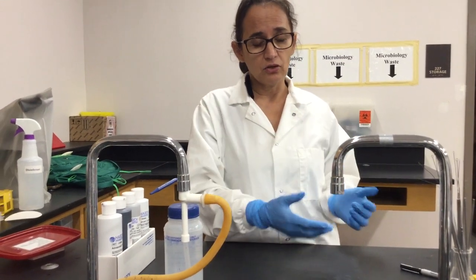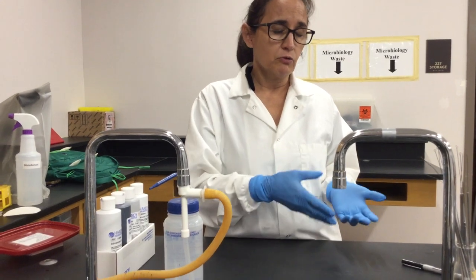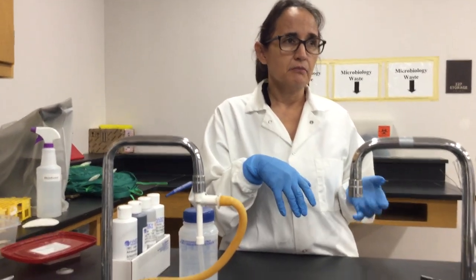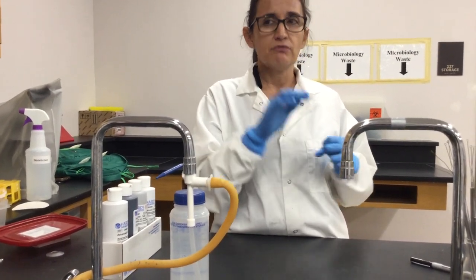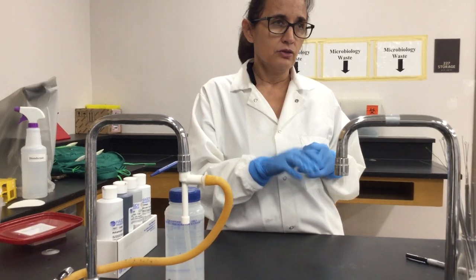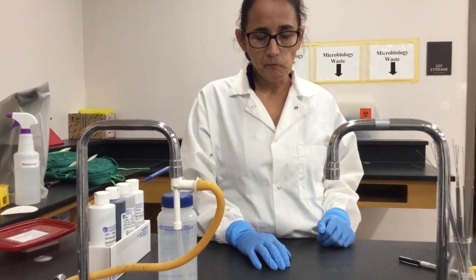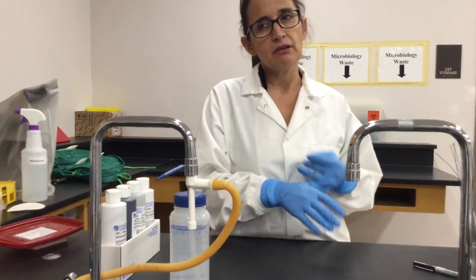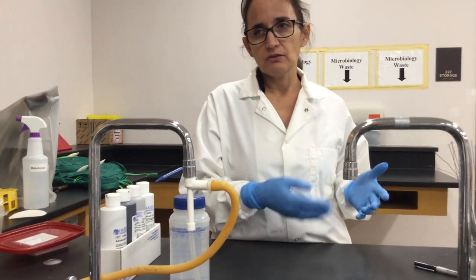And then they can form clusters, like if they were grapes. This is Staphylococcus. And Staphylo comes from the Greek word which means grapes. And then for bacilli, it is the same. You can have single bacilli, you can have diplobacilli, you can have streptobacilli, and you don't have Staphylobacilli. That's the only difference. And then you can have, of course, gram-positive bacilli, gram-negative bacilli, and cocci as well.